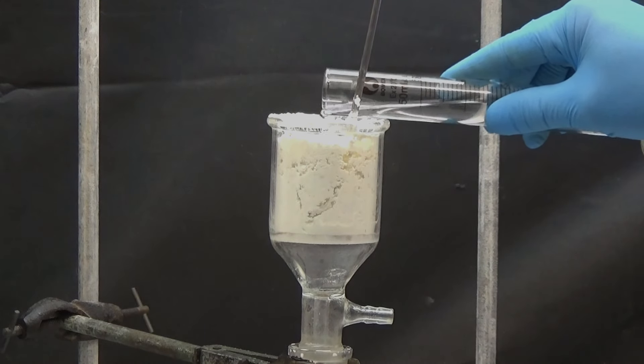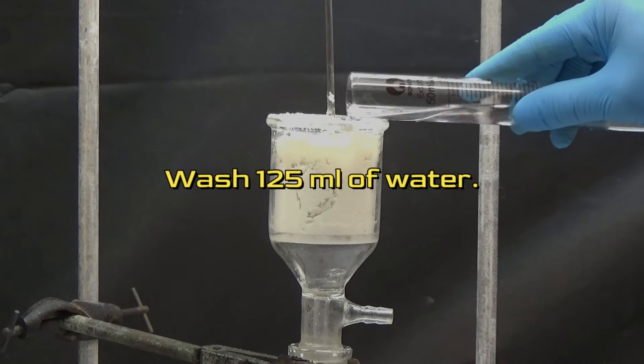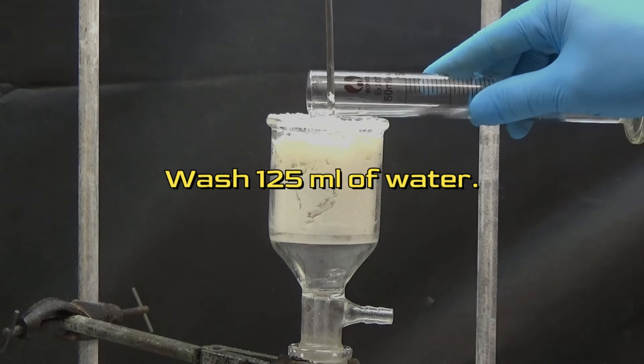To wash the obtained product, we first wash it with 250 milliliters of water to eliminate residual ammonium chloride.